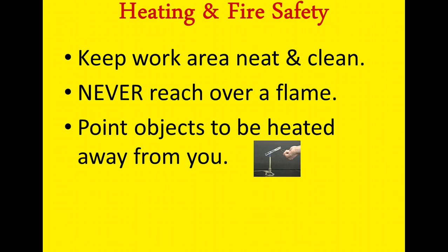Always point objects to be heated away from you. So if we were to heat something up in a test tube, you want to make sure that the test tube opening is away from your face, so in case something bubbles out or explodes out of it, that it is not pointed at you. However, please make sure you're not pointing at your lab partner, because we don't want that stuff coming out at them either.